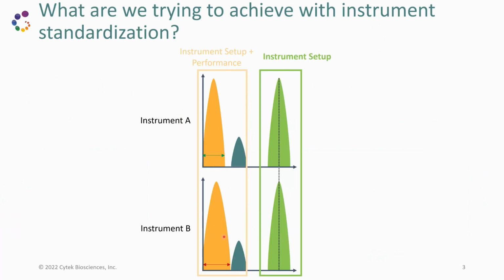And you're going to learn, it can be that the spread, how much spread you have of the negative, is not identical, but that is good enough in both instruments to allow you to resolve the blue.